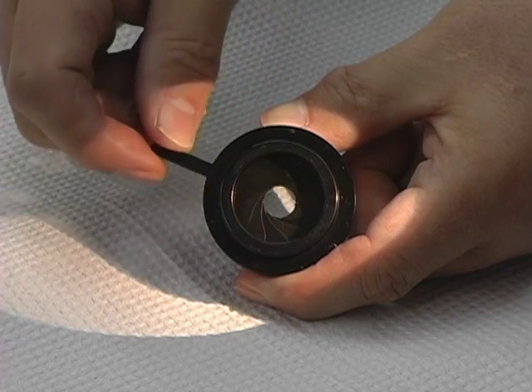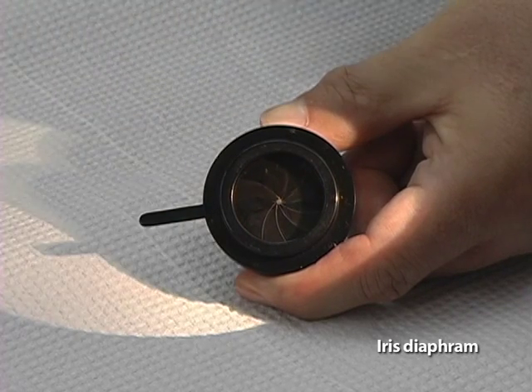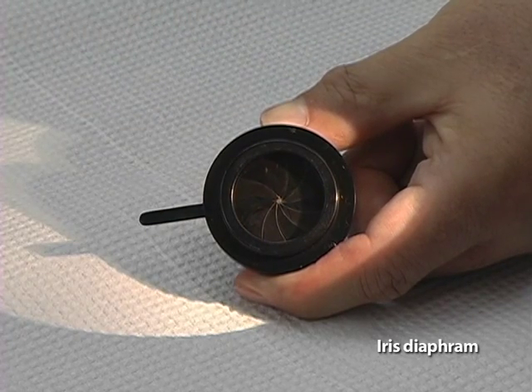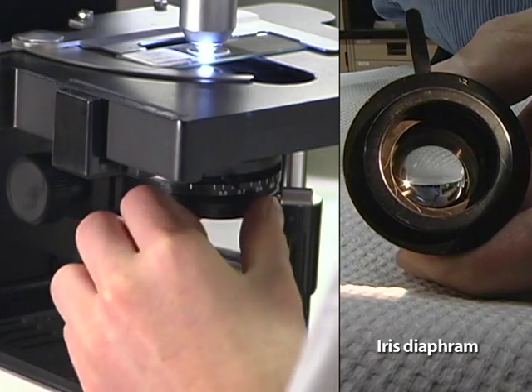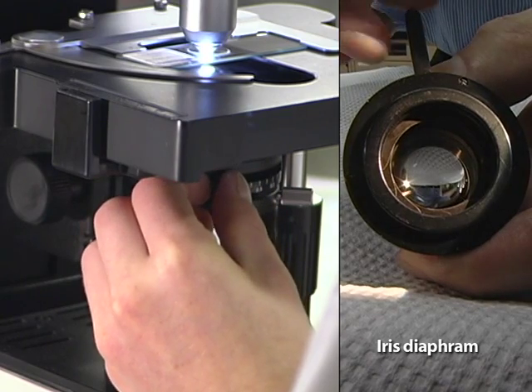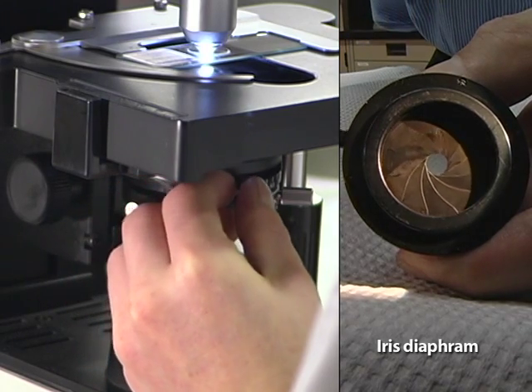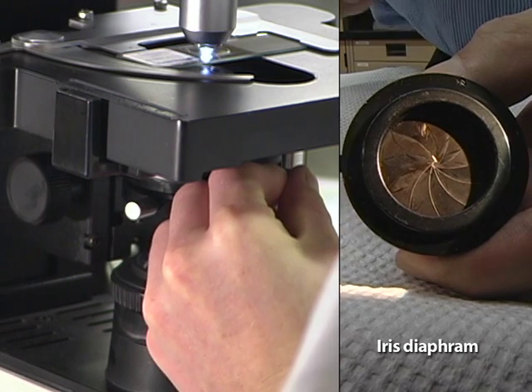Closely associated with the condenser is a device for limiting the diameter of light entering the condenser. The usual mechanism is an iris diaphragm. An iris diaphragm consists of a set of thin, overlapping metal leaves that can be moved by a lever to form a continuously adjustable aperture.